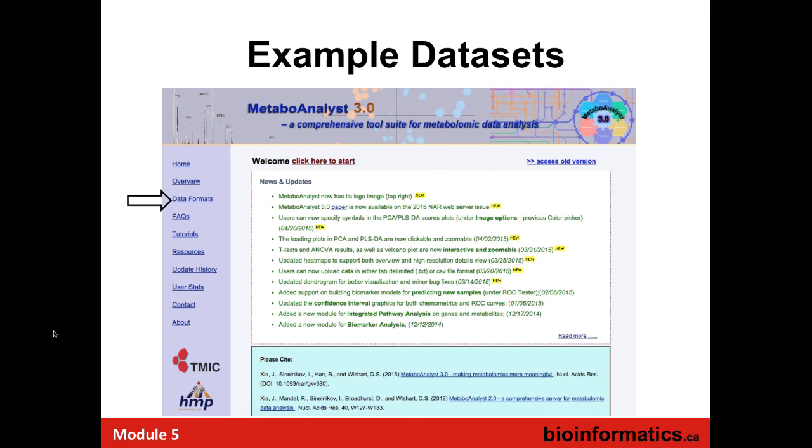So if you go to MetaboAnalyst and you just type the name in anywhere, it'll take you to this website. And it looks like this. I think that the toughest part about using MetaboAnalyst is finding out how to start it. So you have to look in this little tiny spot, which is click here to start. And I've been asking Jeff for almost 6 years to make the font bigger.